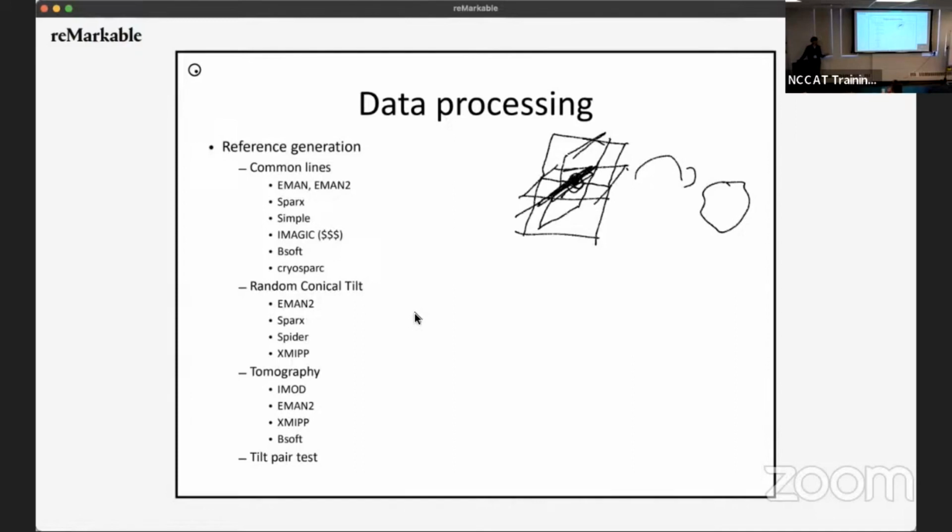we can have mistakes. But nowadays, our reconstructions most of the time go sub-nanometer or sub-6 angstrom. And so at sub-nanometer, you see alpha helices. If you see alpha helices that look really much like an alpha helix, it means your model was right, and therefore you can keep going. And if on top of that you see the pitch of your alpha helices, it's a pretty foolproof result, which means that your initial reference was correct, and you can just keep going without thinking about it ever again.